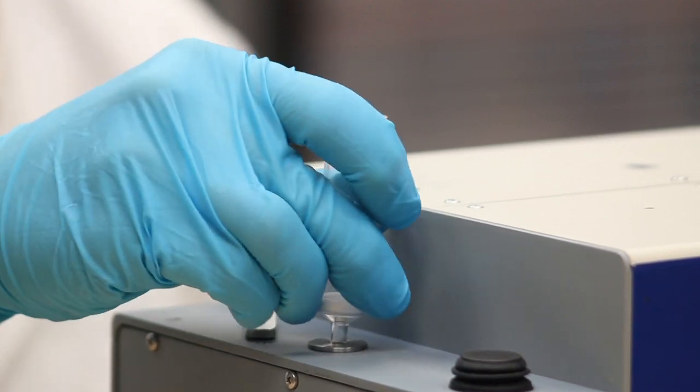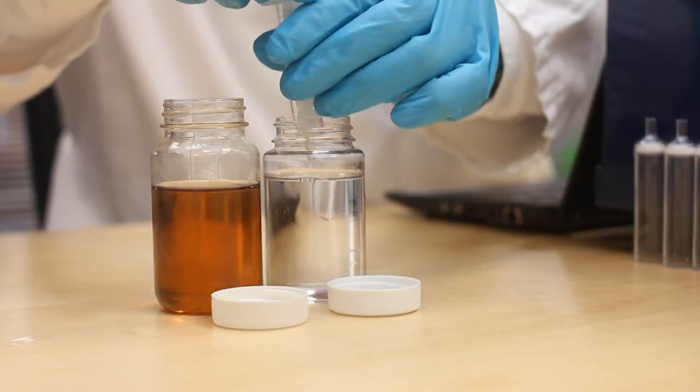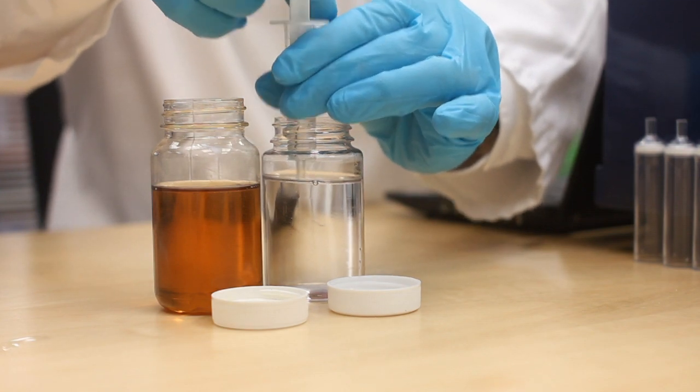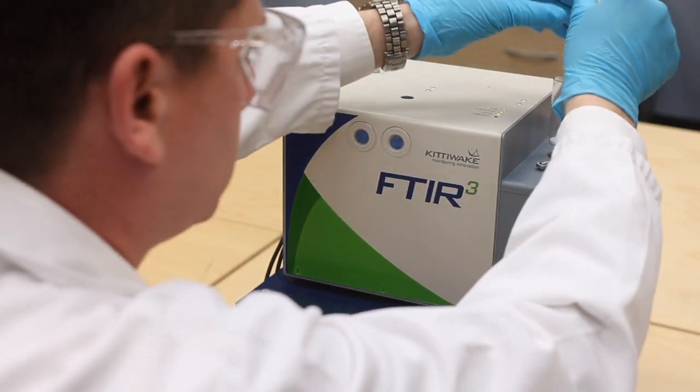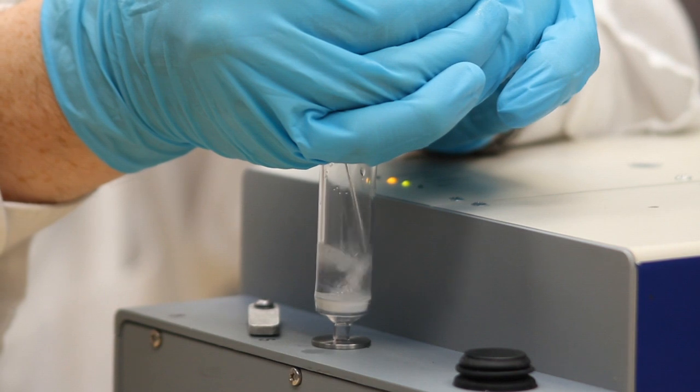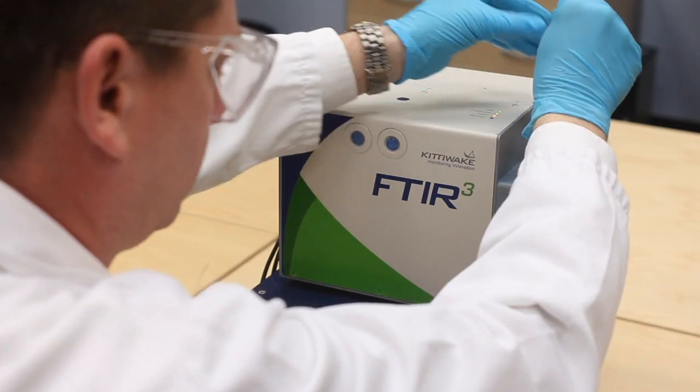A clean sample tube is placed into the FTIR Cubed. A small sample of cleaning fluid, for example kerosene or mineral lamp oil, is then used to flush the oil sample through and clean the measurement cell.